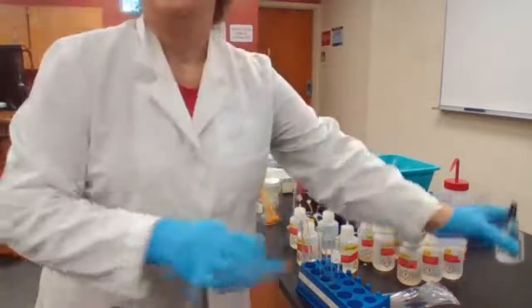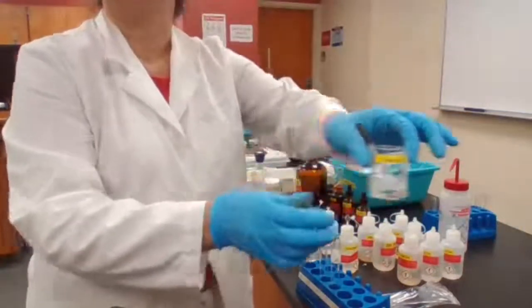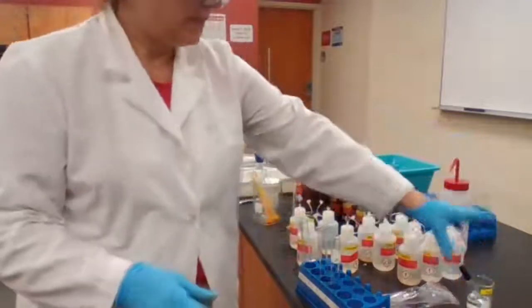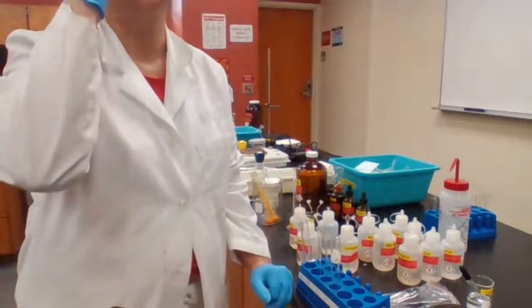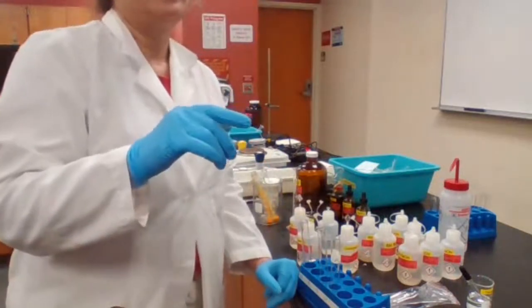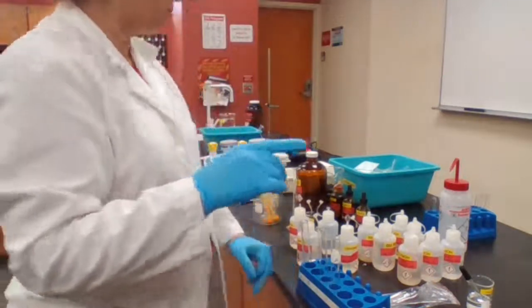Adding 2 milliliters of dioxane to each one. Then we are going to add, oh, you're moving faster than me. Okay. Then we are going to add 2 milliliters of water to each.